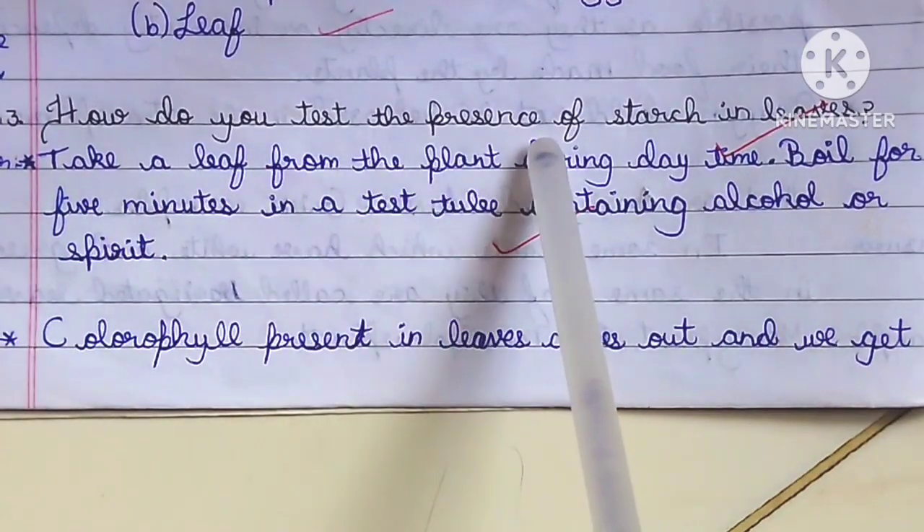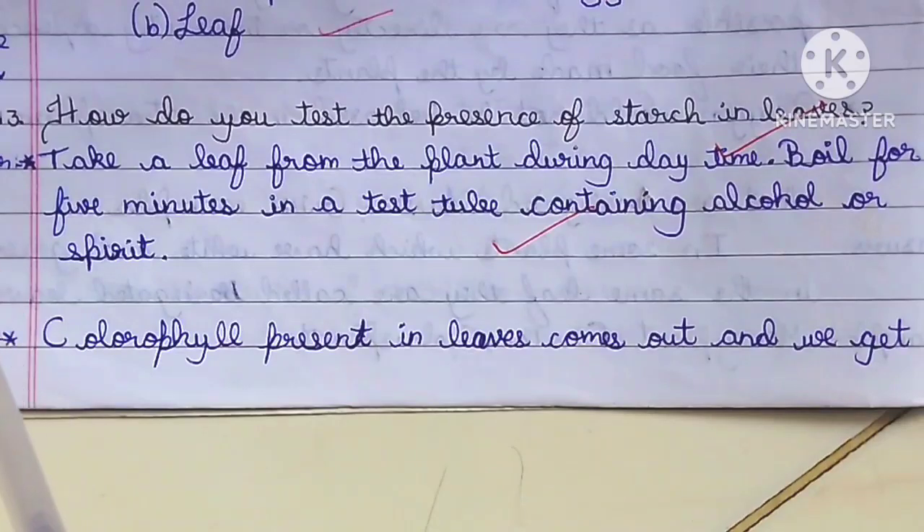How do you test the presence of starch in leaves? Answer.